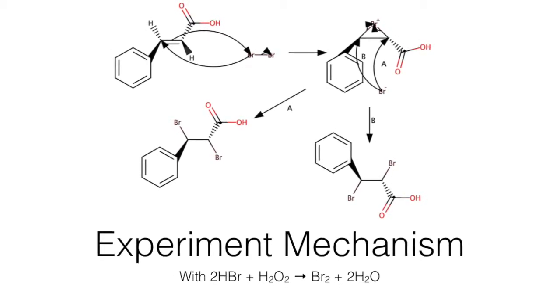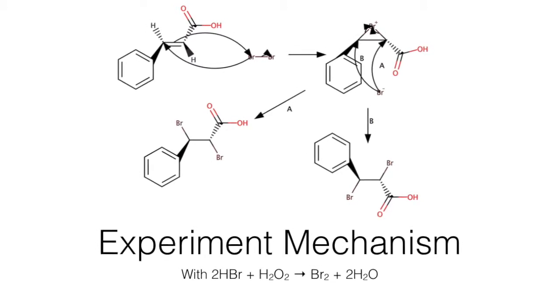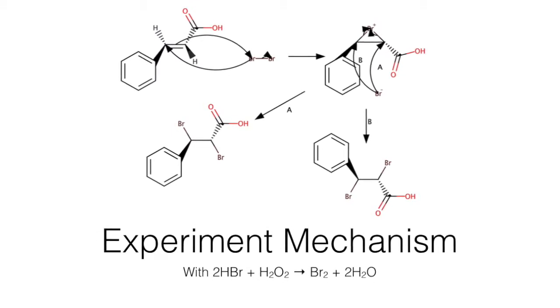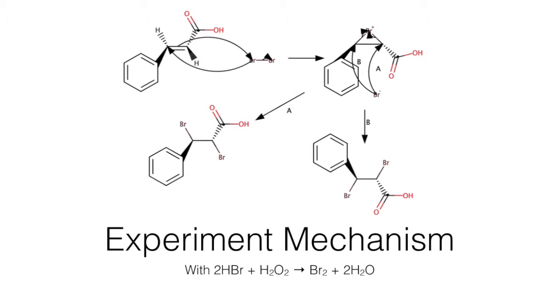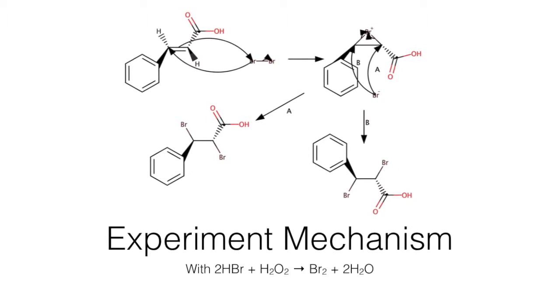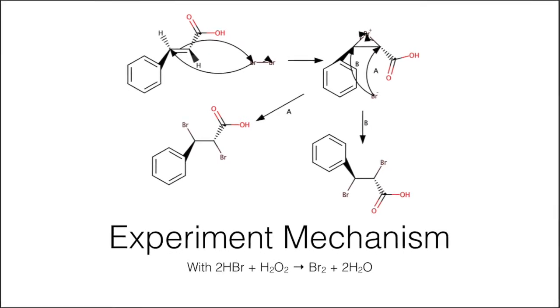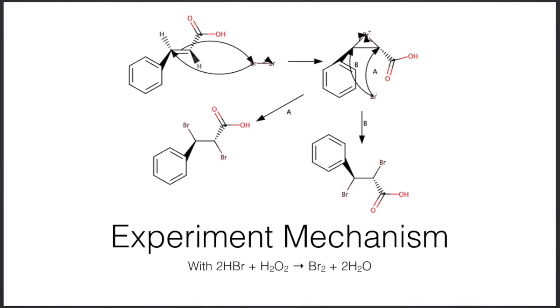This bromination can be executed through several different methods. However, solvents such as methylene chloride and pyridinium tribromide can be extremely dangerous, and their reactions produce unneeded waste. Therefore, a more green method of bromination, utilizing hydrobromic acid and hydrogen peroxide to form the dibromide with a byproduct of water, is the suggested reaction in recent literature.